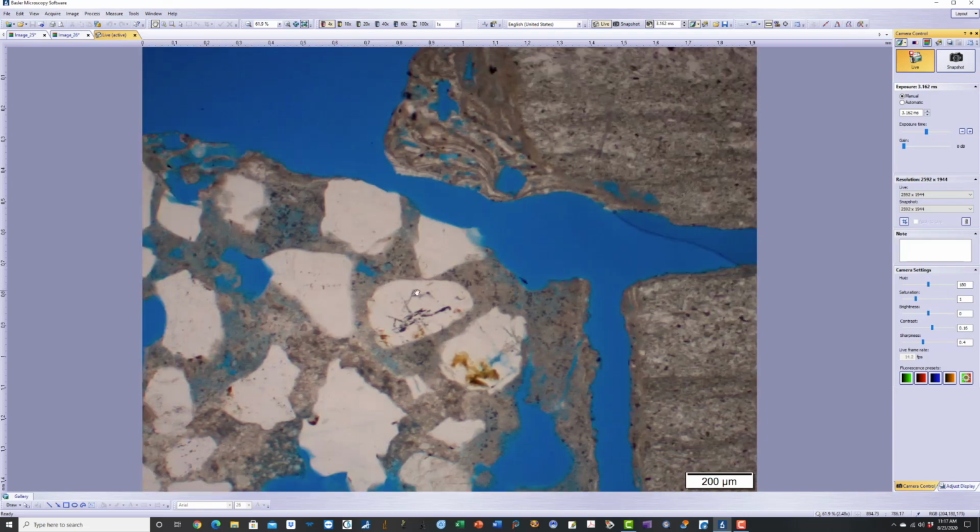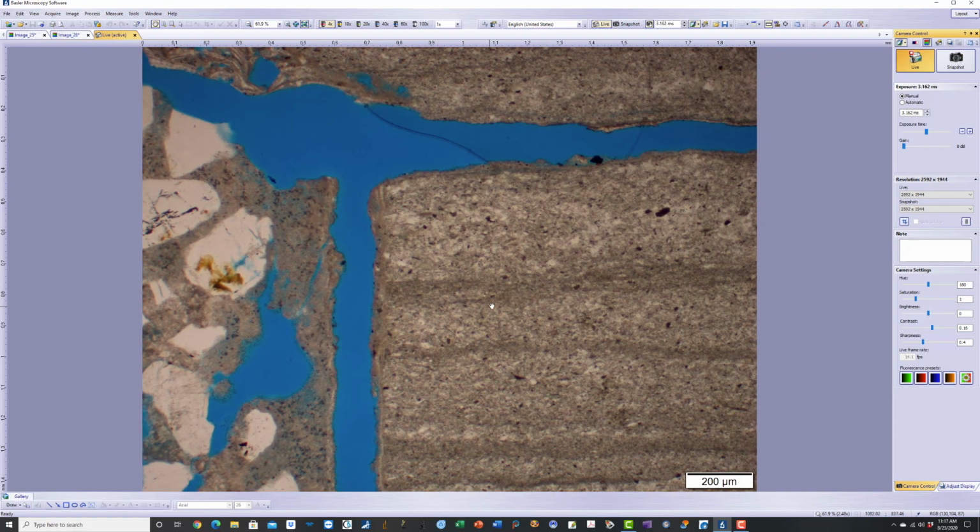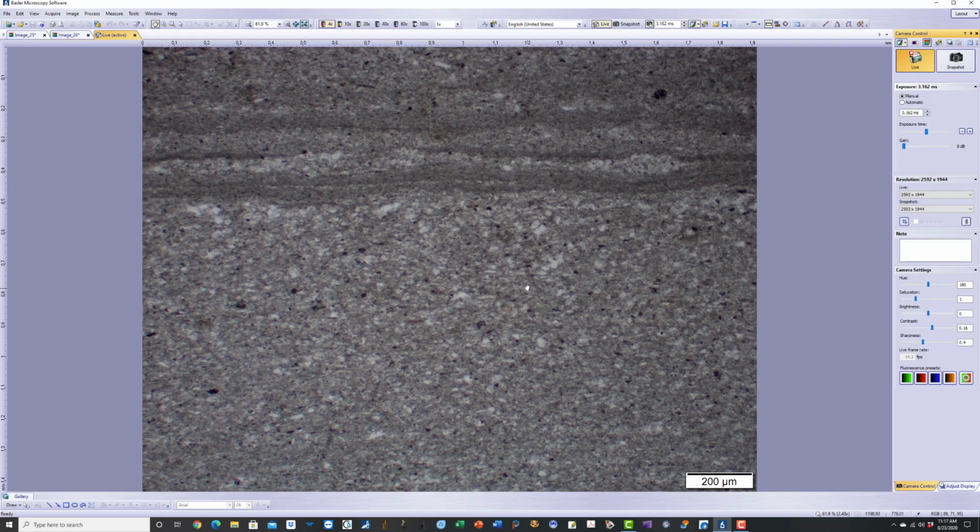And that happened from using a rich cement mix in the mortar with no lime, where a mortar created undue stress on the slate, and the slate, having the slaty cleavage, created the scaling on the surface. You can see the silt and clay mixture.